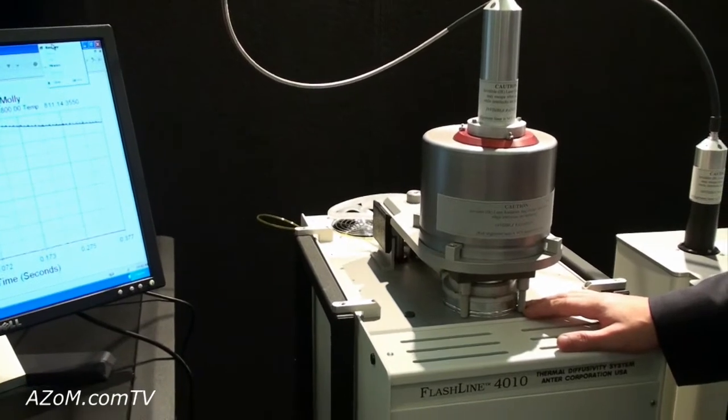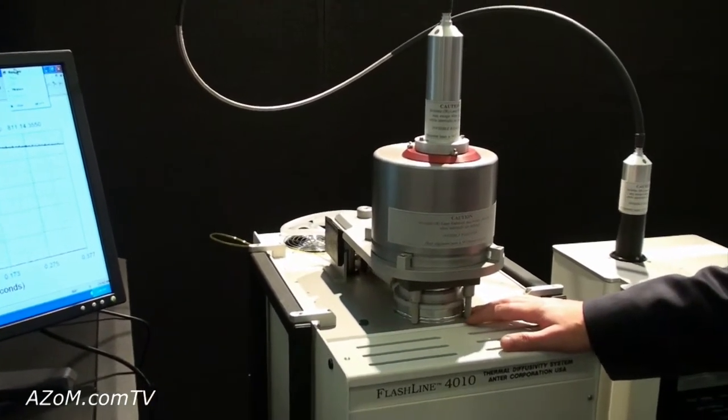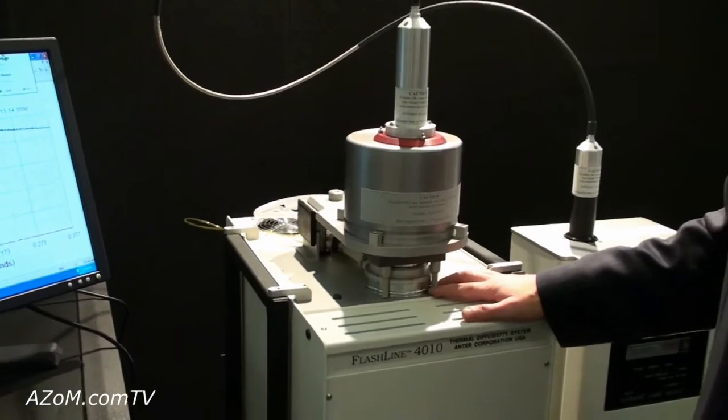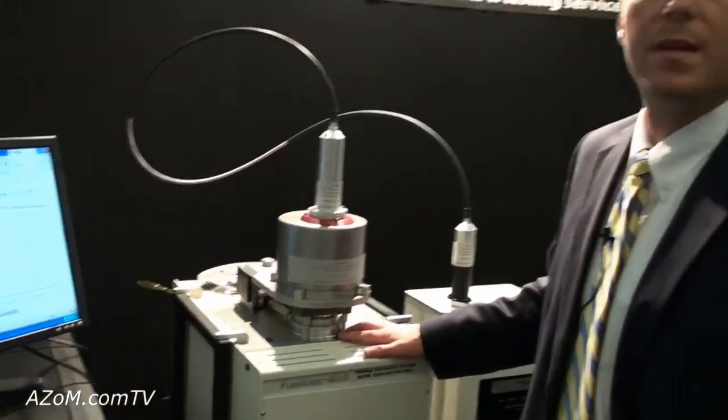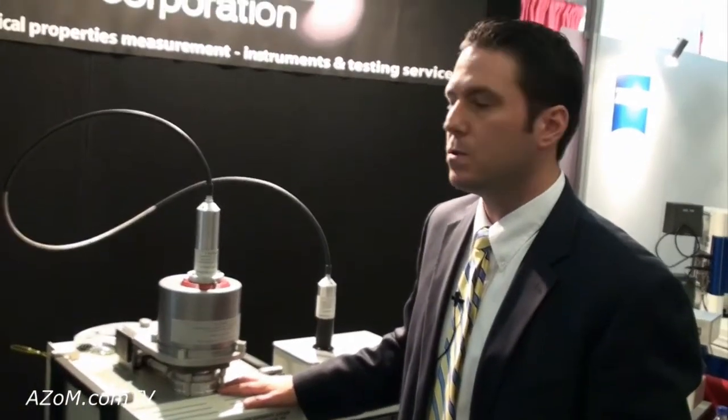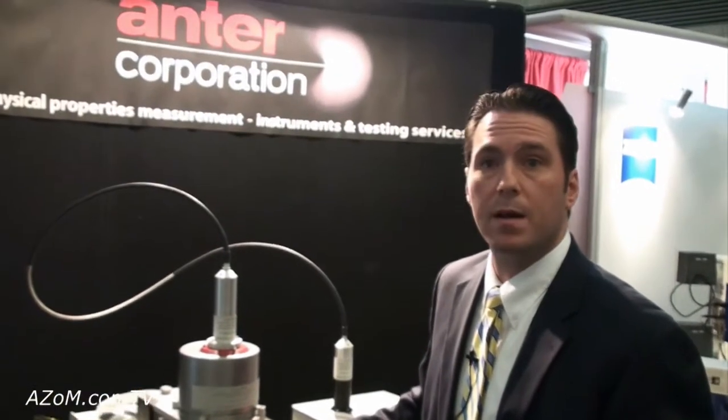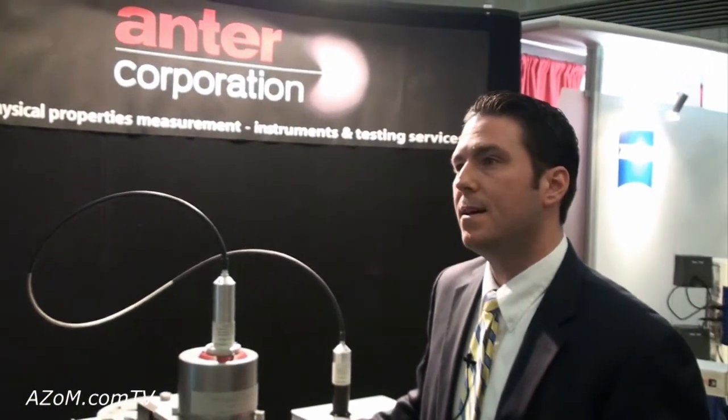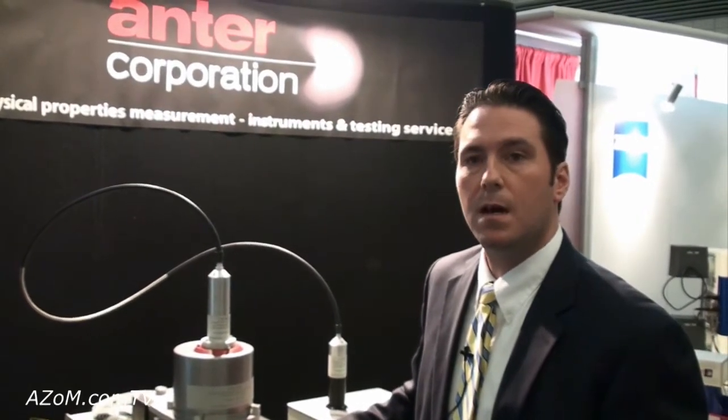What sort of industries typically use this type of testing? Any material developers, material research firms, anybody trying to develop materials of greater thermal conductivity. Here the typical use would be in ceramic studies, in developing higher thermal conductivity ceramic materials.